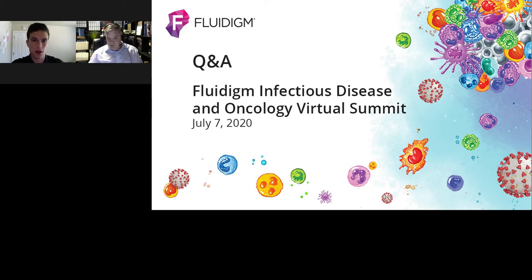Awesome. So a question here, are p-values adjusted for multiple testing? Yes, I think that question probably goes back to the bar plots and the box and whisker plots that Dave Novo was showing during the presentation. The way that the p-values work in FCS Express is just like you would work in a spreadsheet in Microsoft Excel. Whatever data that you have in that spreadsheet is going to be what the p-values are based off of. So in the example that was being shown, it was 2 sets of, I believe, 4 tubes each that were being compared to each other.